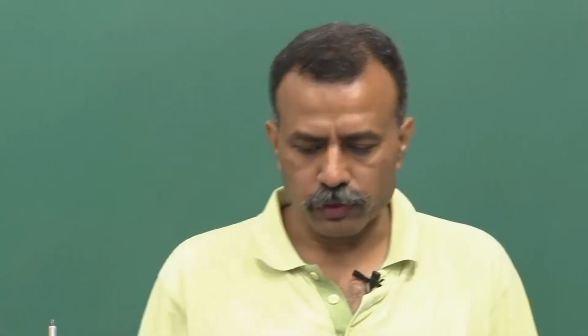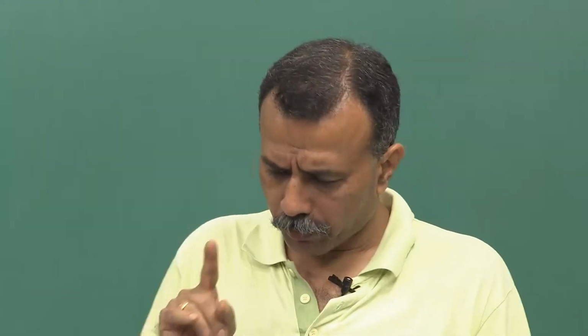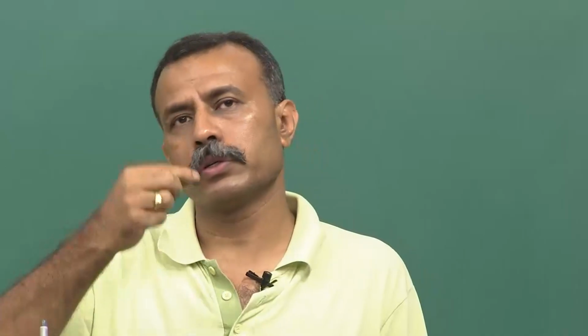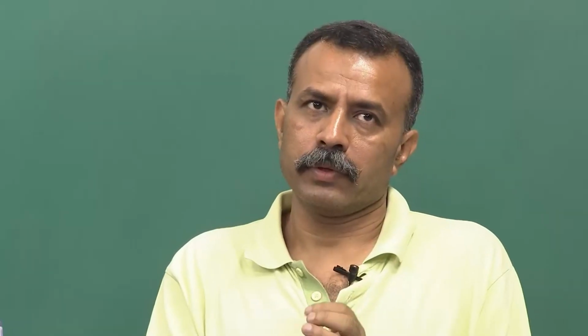So, in the last lecture we talked about the mechanical dissociation of the hippocampal tissue, and this whole mechanical dissociation process is uniform. I am just taking up one simple example, and one has to be slightly careful while you are doing mechanical dissociation, while you are offering a shear force to the piece of tissue to dissociate it into single cell suspension. You ensure that you are not picking up air bubbles. Those air bubbles damage the tissue big time. So, you will always have to do it very gently. So, there are some thumb rules in mechanical dissociation.